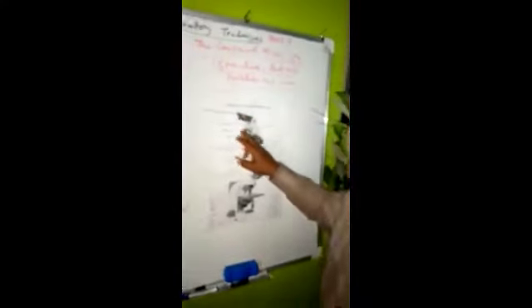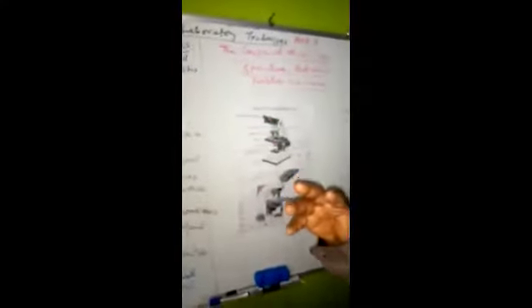Use cotton wool to cover the eyepieces and these areas so that they will not gather dust. The microscope is not an instrument that you use for playing. If it's not in use, store it properly, out of dust. If you want to clean it, get the special liquid for cleaning. You will see that the microscope will serve you for a long time before it goes out of use.